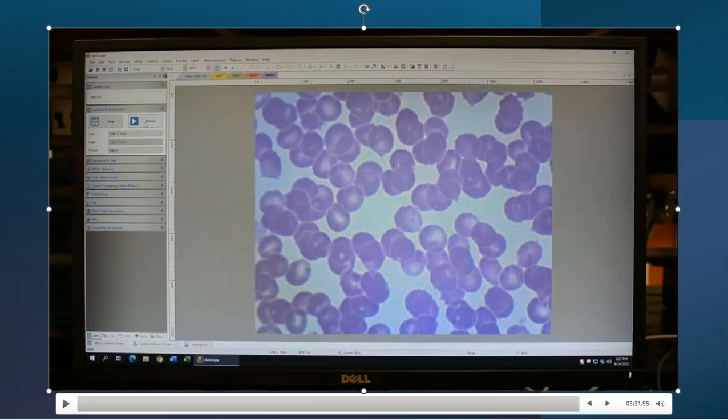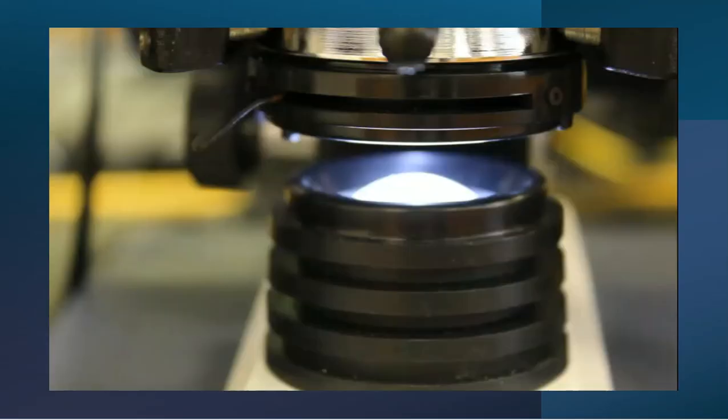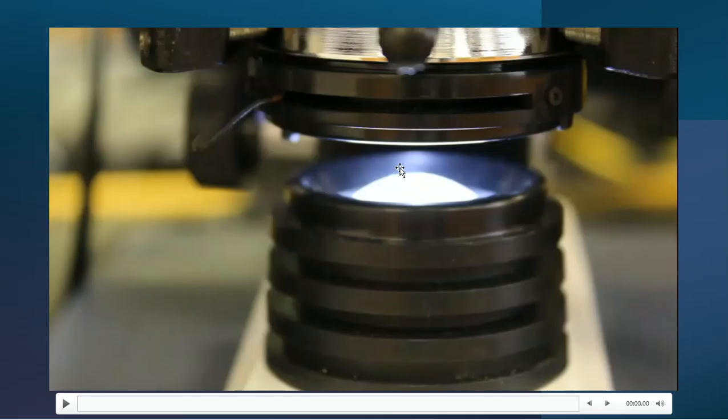All right, guys, so before I let you go, just a couple more pictures that, again, I want to share with you. In the last video, you heard me mention that there was a little bit of an issue with a light bulb not being bright enough. And the light bulb is here at the very bottom. That's what I was referring to.